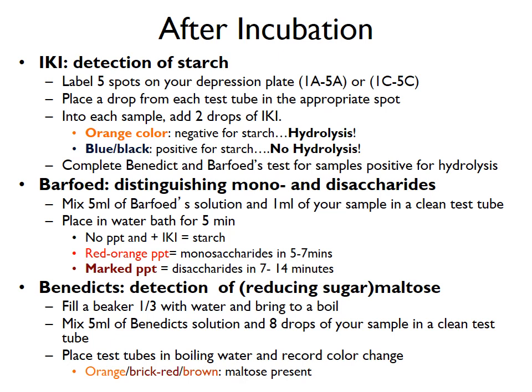And if you didn't see any precipitates, even though the sample is positive for IKI, it means that you still have starch in your sample. There's no monosaccharide or disaccharide. But if you see that your samples at 5 to 7 minutes after incubation, or during incubation, turn orange-red, then it means that you have monosaccharides in your sample.